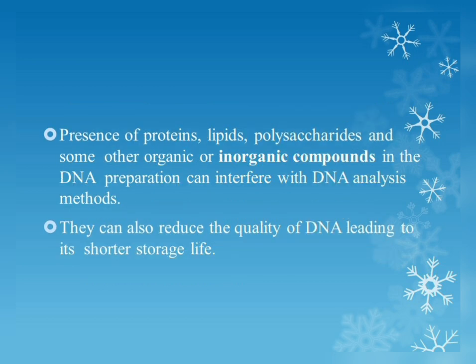Next, the presence of proteins, lipids, polysaccharides, and some other organic or inorganic compounds in the DNA preparation can interfere with DNA analysis. It means the organic compounds, inorganic compounds, and some other compounds can interfere with the DNA analysis method. They can also reduce the quality of DNA, leading to its shorter storage life.